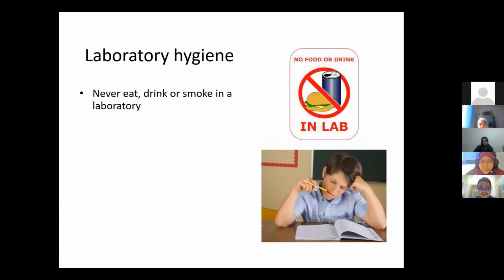Okay. So laboratory hygiene. Never eat, drink, or smoke in a laboratory. I'm sure none of you students smoke. Yeah. But they may eat and drink. I'm a bit lenient on this part. If you want to drink, you make sure that the drink is being put in the bag. Macam bila awak nak minum, cepat-cepat masuk balik dalam bag and plain water only.